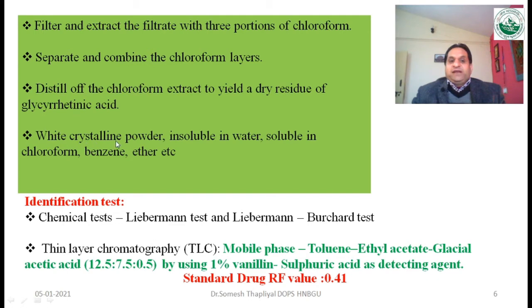Okay, it is a white crystalline powder which is insoluble in water and soluble in organic solvents like chloroform, benzene, ether, etc. So that is the extraction procedure, but in the extract there may be the presence of some impurities and other components.